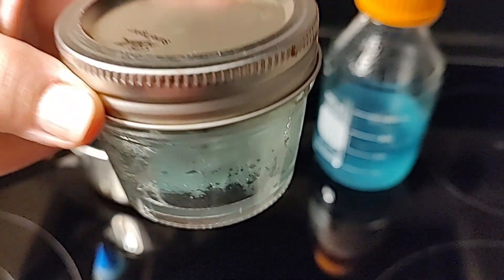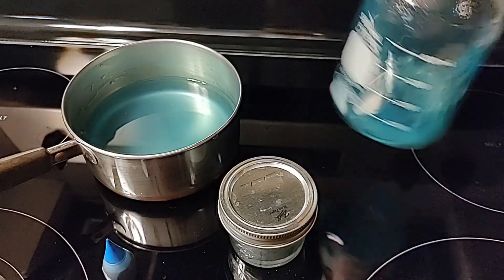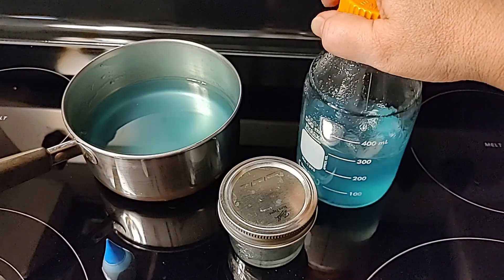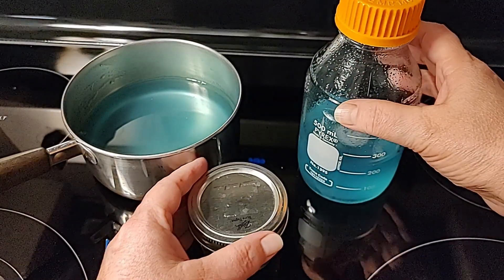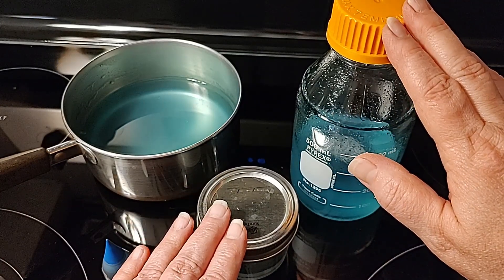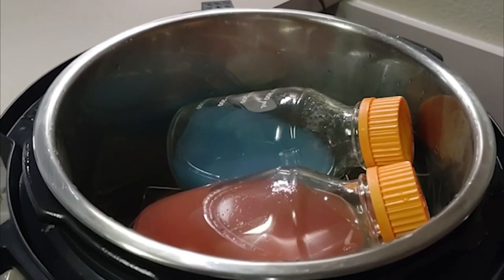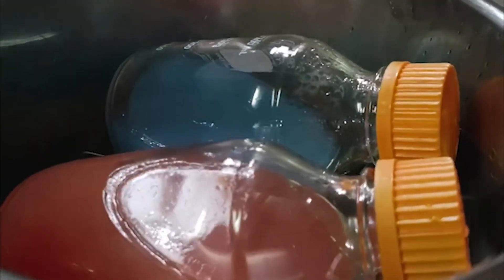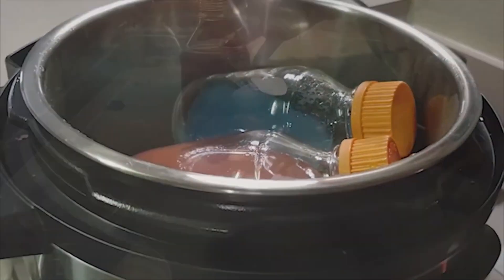You will need to pressure cook these no pour jars or your bottle before you pour your petri dishes in a still air box or in front of your flow hood. Those will need to go in the pressure cooker for 20 minutes at 15 psi. The only difference with adding the food coloring is just adding one drop to what you're already doing, and you can make each recipe a different color.